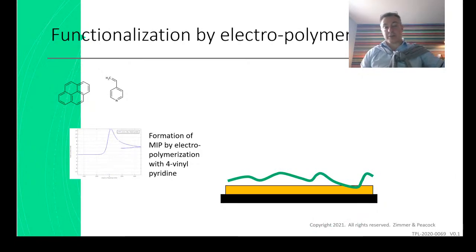Yeah, there we are. I'm just commenting on something that Ali said. Ali says that's right. The supporting electrolyte is a very important factor when doing EIS. Yeah, I agree, Ali. I'm just referring back to the aptamer question, they want to do label-free detection, and you can do label-free detection, but be sneaky and put a little bit of redox reporter into your buffer, or cast it near your electrodes, so that will help with your signal.